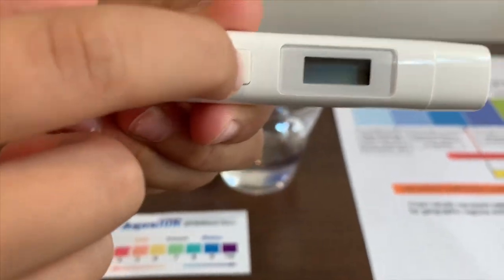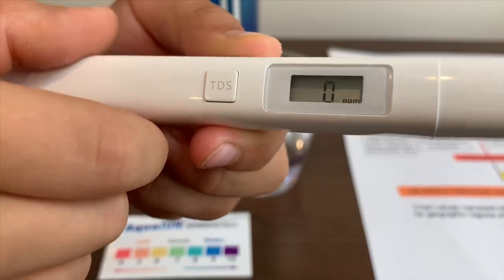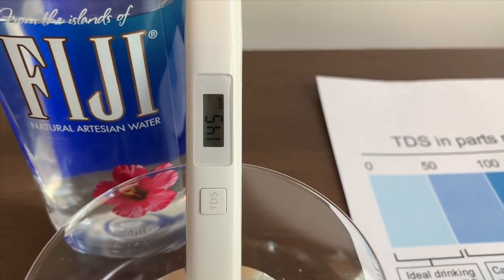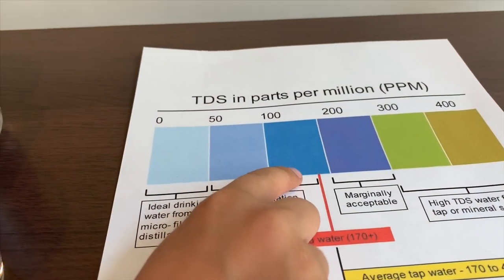Turn on the TDS tester, make sure it says 0, and put it in. 145. That is okay to drink.